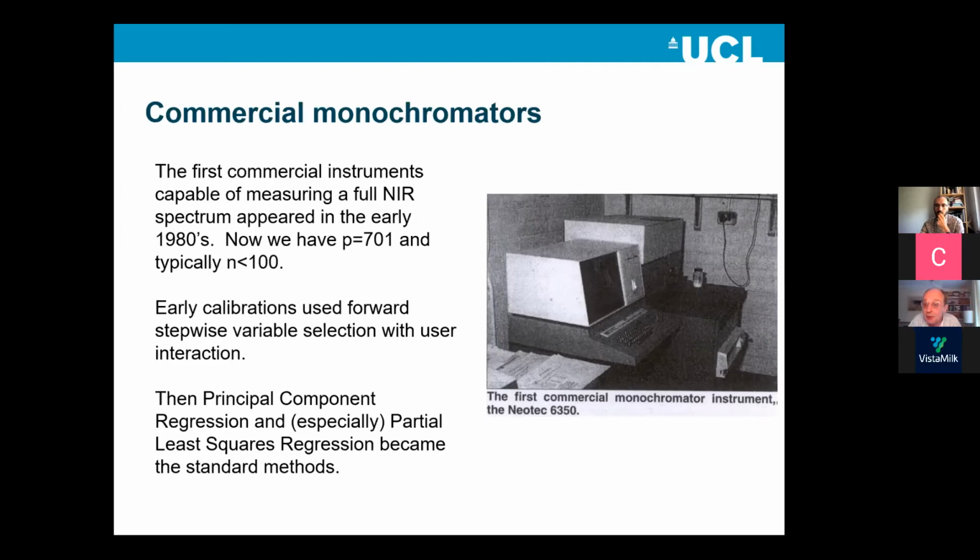Why did we move away from the ratio of derivatives? If Norris was getting great success with this art, did we lose this by sticking data into a package and getting an answer? No, it's an interesting question. I think the reason we moved away from it basically is that there was a lot of Carl Norris in it. So what you could do, and I don't know if anybody's tried to do it, is you could write software that would search over equations using ratios of derivatives, and possibly even search in a limited way over the window, for example, for a Savitsky-Golay filter. And I'm a bit surprised that hasn't been followed up.